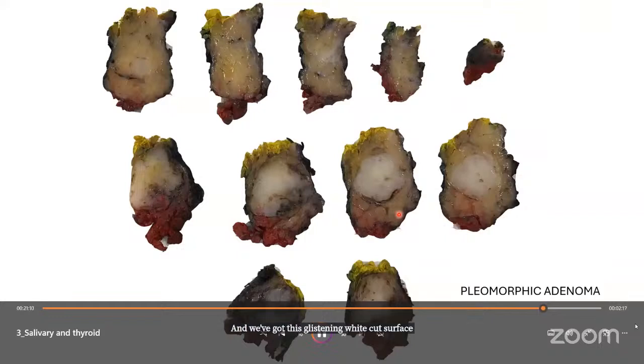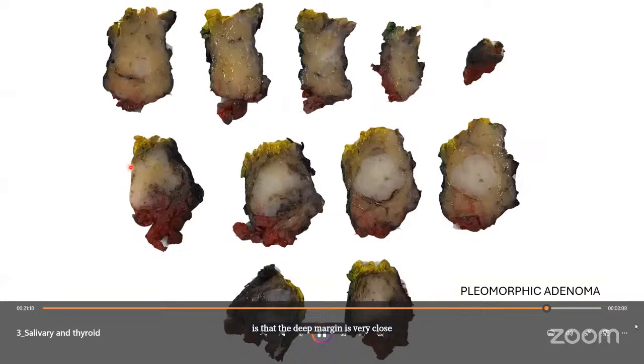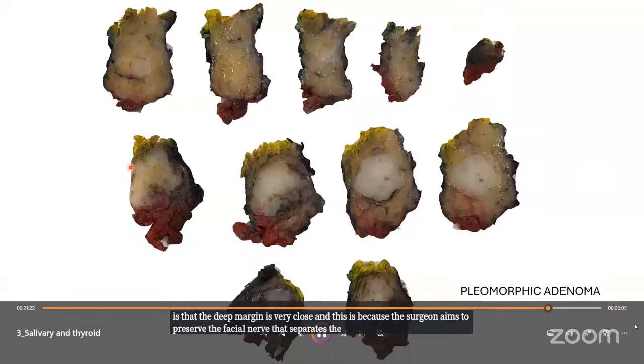Now, what we often find with superficial parotidectomies and pleomorphic adenomas is that the deep margin is very close. And this is because the surgeon aims to preserve the facial nerve that separates the deep lobe from the superficial aspect. So quite often we will have a close margin at the deep aspect, and this just needs to be communicated back to the surgical team.